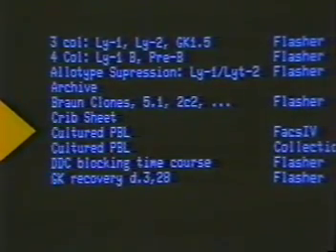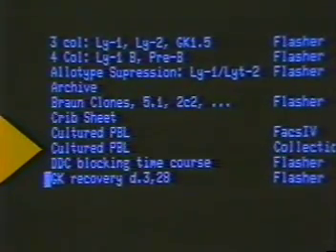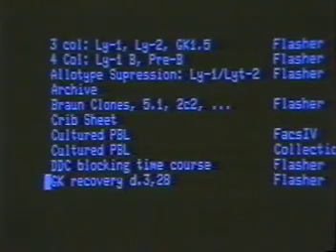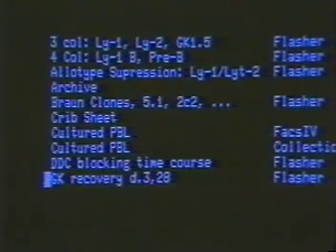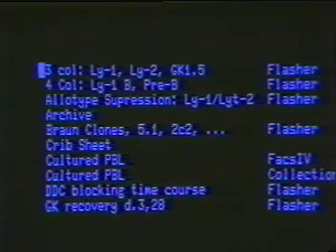There are 2 drawers entitled Cultured PBL. The upper drawer is an analysis drawer. The lower drawer stores the protocol for this experiment. It is now in the collection mode. When all of the drawers on a desk are closed, the screen displays only the drawer labels and the cursor. You may think of the cursor as a pointer with which you focus the magic secretary's attention.